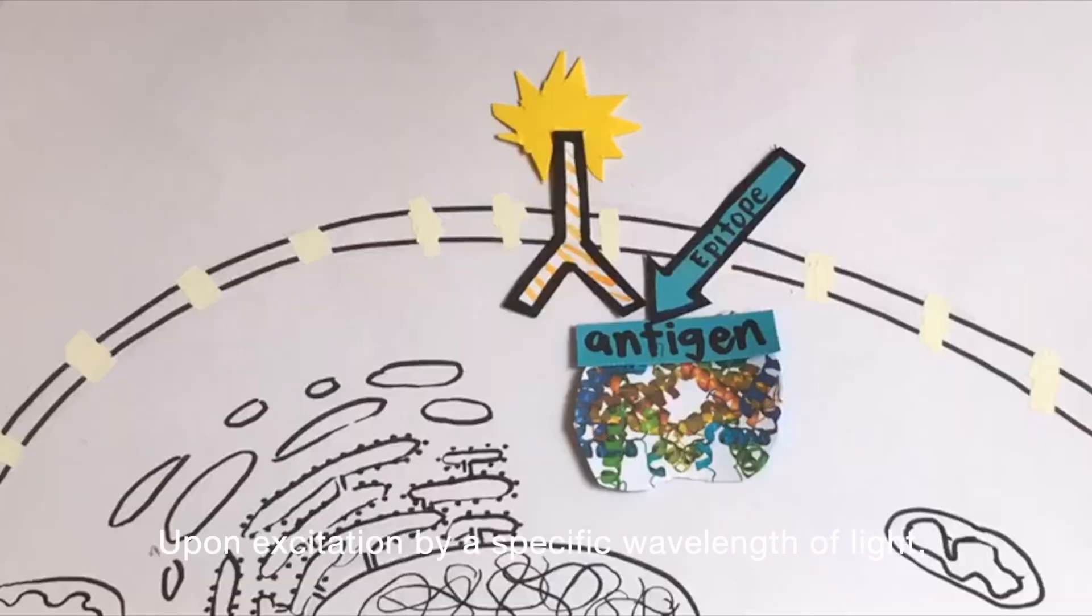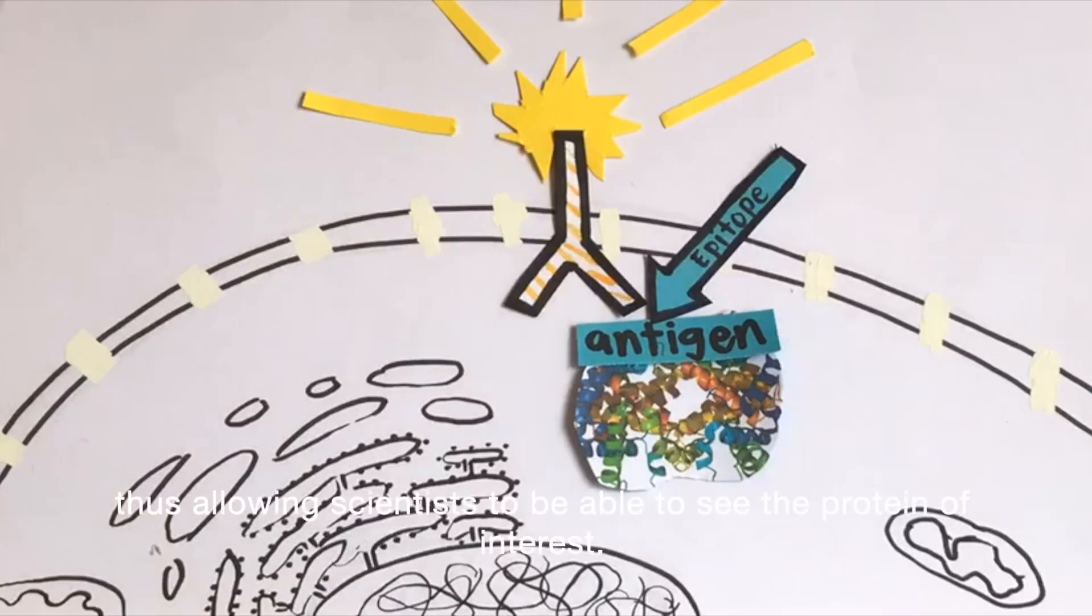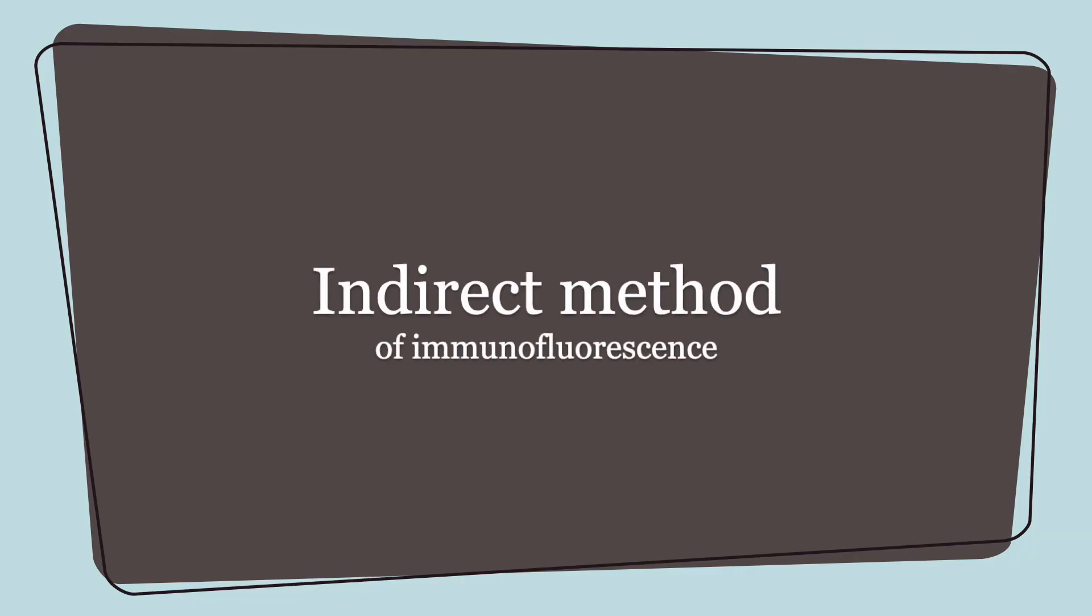Upon excitation by a specific wavelength of light, the fluorochrome emits light, thus allowing scientists to be able to see the protein of interest. Then what is the indirect method about? You may wonder.